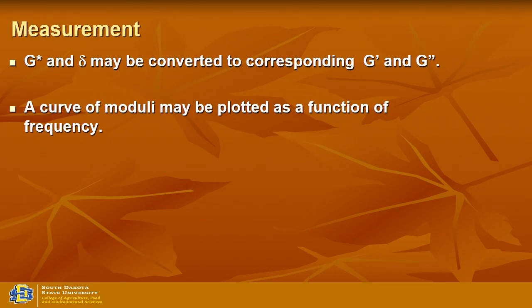So with the sinusoidal wave, you can plot a curve of moduli as a function of frequency, and that's what you probably saw at today's lab, where you have the frequency sweep experiment they did. Amplitude. Okay. So in this test, if you want to have a quality data output, the first thing you do is find out the linear viscoelastic region of your sample.